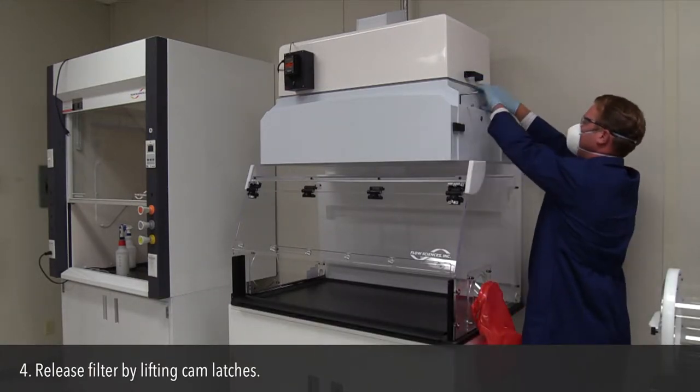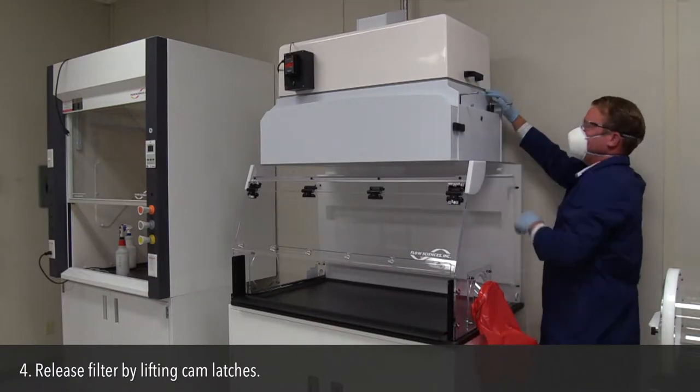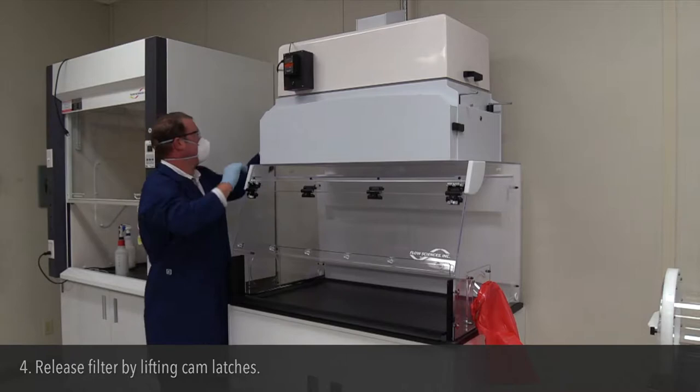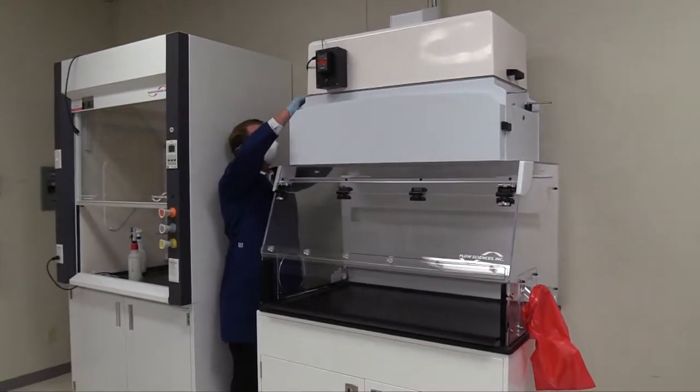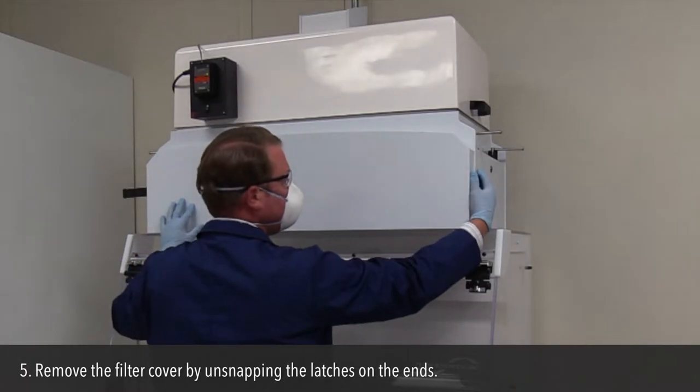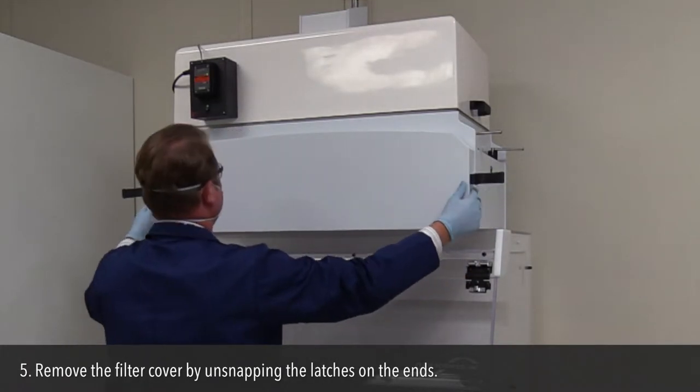Step 4: Release the filter by lifting the cam latches. Step 5: Remove the filter cover by unsnapping the latches on the ends.